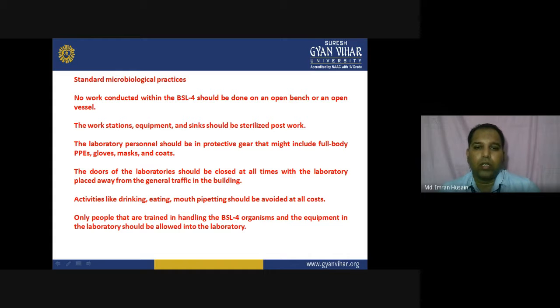The doors of the laboratory should be closed at all times, with the laboratory placed away from general traffic in the building, mostly situated in isolated areas. Activities like drinking, eating, and mouth pipetting should be avoided at all costs. Only people trained in handling the BSL-4 organisms, who are highly trained and highly valued individuals, and the equipment in the laboratory should be allowed into the laboratory.